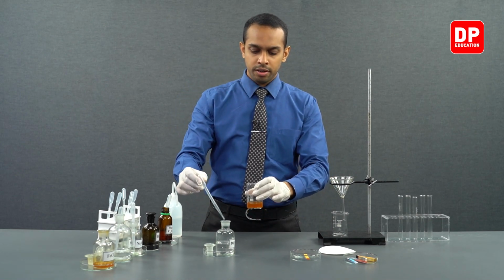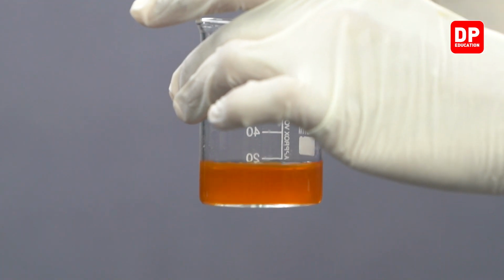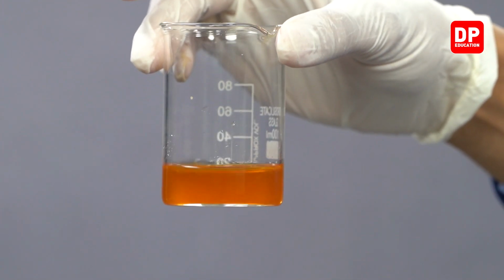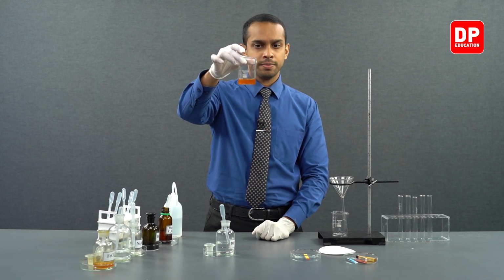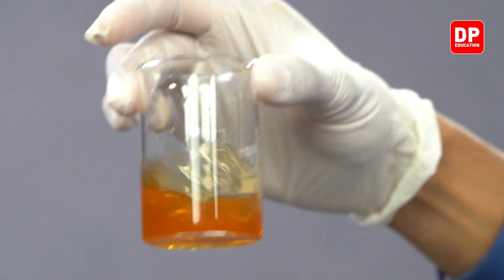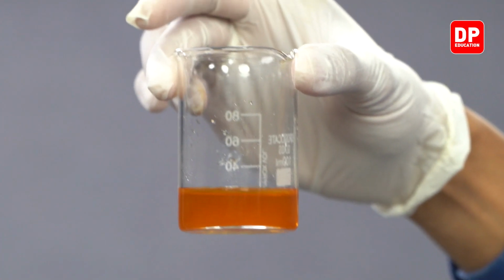We'll add a few more drops of ammonium hydroxide. If you observe a persistent brown color precipitate forming, that indicates the presence of ferric hydroxide. We still can't see a persistent precipitate here, meaning we should add more ammonium hydroxide.